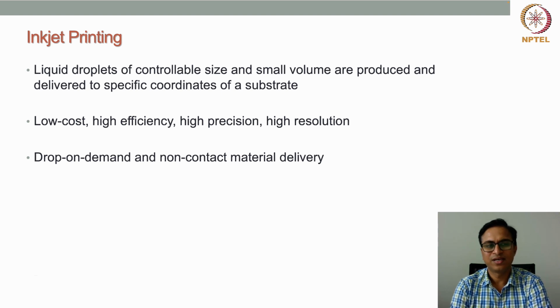So till now we have discussed what is bioprinting, and what the different types of bioprinting techniques available are. In this lecture we'll discuss inkjet printing technology, or inkjet 3D bioprinting technology. Inkjet printing is a very common technology; in most of our offices we have printers, and some of the printers work on this inkjet principle.